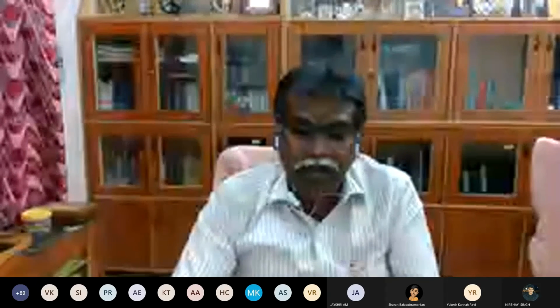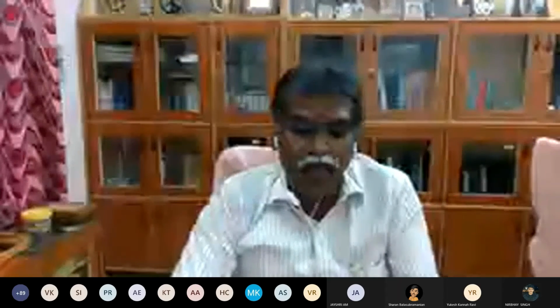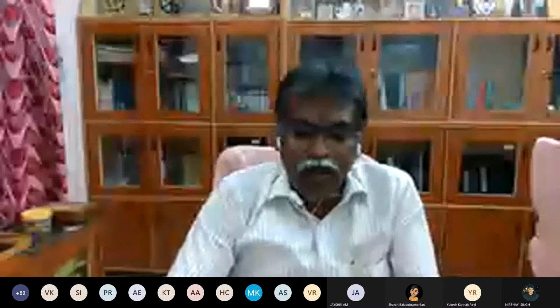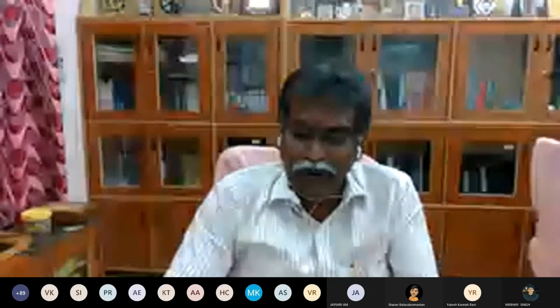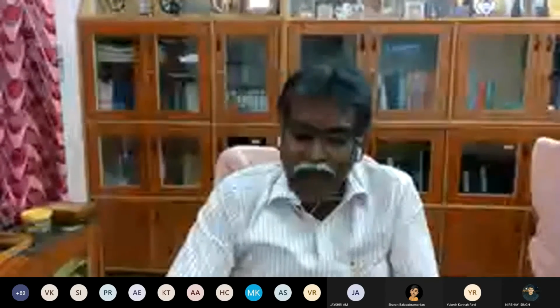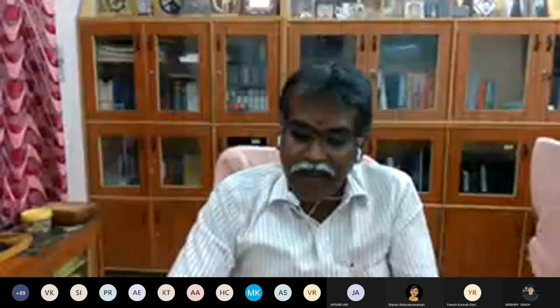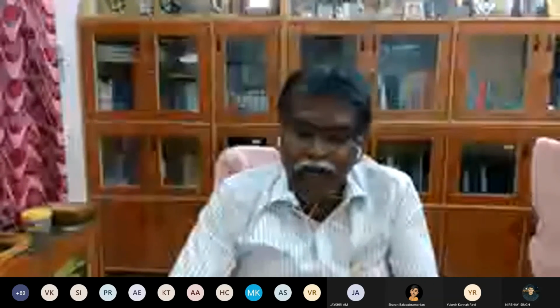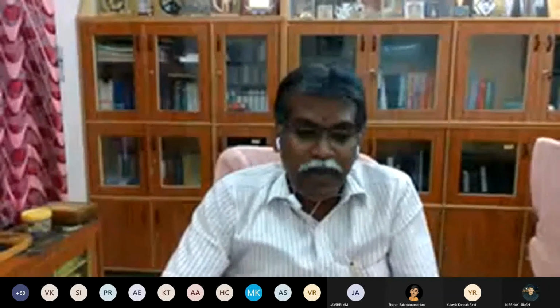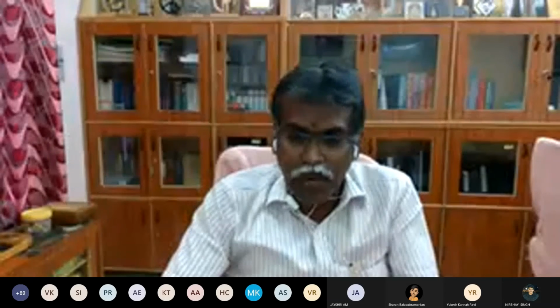The measurement of turbidity in settled water prior to filtration is useful in controlling chemical doses also. That is what I told you. And turbidity measurement of the filtered water is needed to check for faulty filter operation. That is important. If you take a sample here and it shows a lot of turbidity, then you can look back immediately at the filter operations. There could be damage in the filter, or the filter is not working properly.